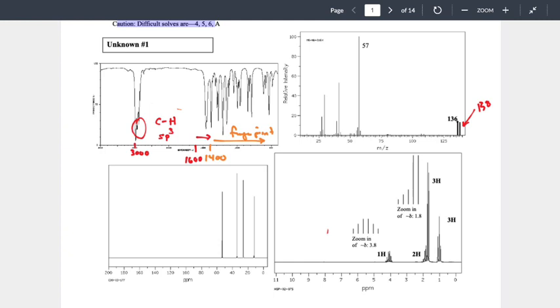So I just have to look for the M+2 and say, are those 2 peaks about the same? Yeah, bromine's present. What about chlorine? Chlorine is roughly 75%, I'm kind of making up the numbers so I'm not 100% sure for the record, 75% chlorine 35 and 25% chlorine 37. So what you end up seeing there is a 3-to-1 ratio. All the other elements that we're concerned about don't have enough of an isotope effect that we need to worry about. So when we go through and deal with our mass spec, we're getting the molecular weight of our compound. We're now looking for that M+2, and now we draw a conclusion from it.